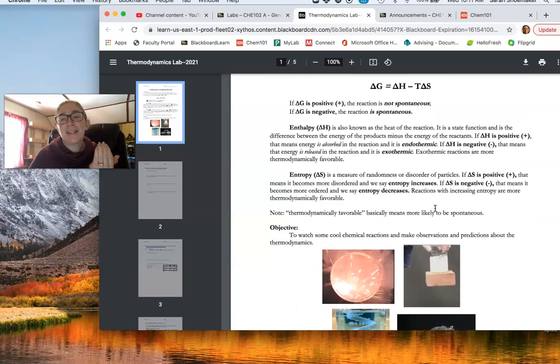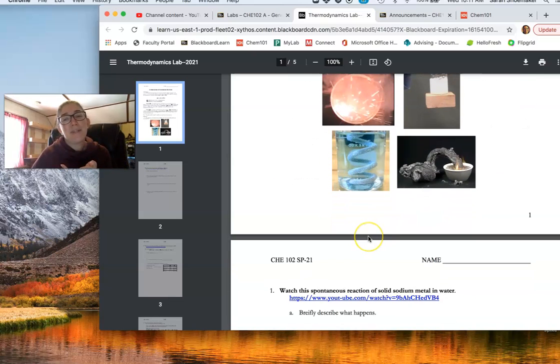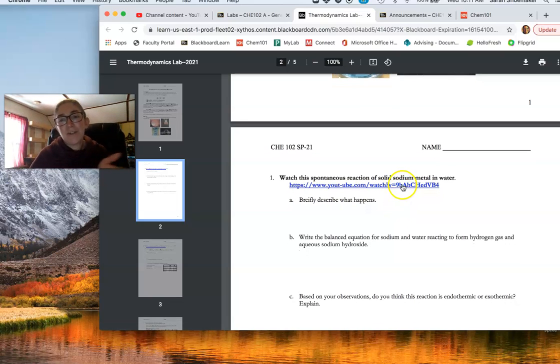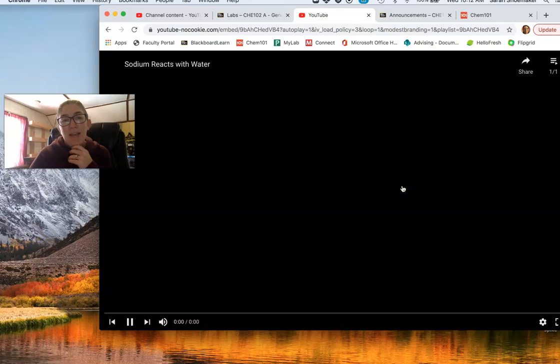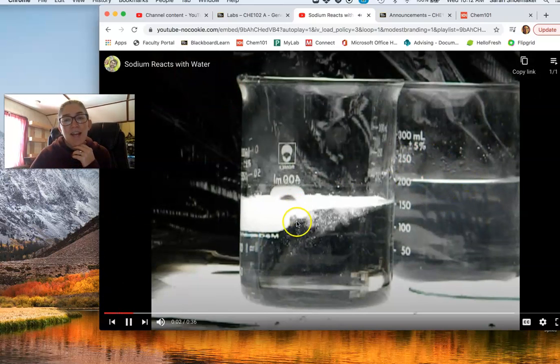So normally in class I would perform these or I would watch the videos with you. And so just in case it's not clear doing it by yourself, I wanted to make this sort of walkthrough video. So the first reaction you're going to watch is the spontaneous reaction of solid sodium in water. And it's pretty explosive. So this teacher adds sodium to water.